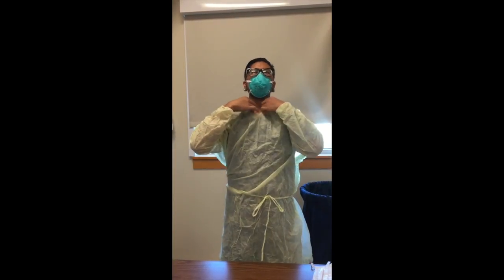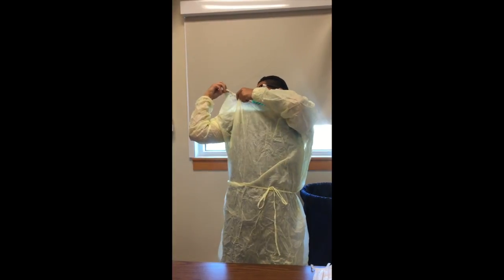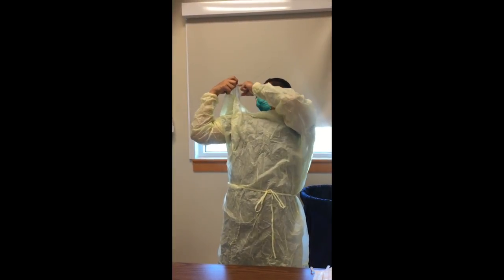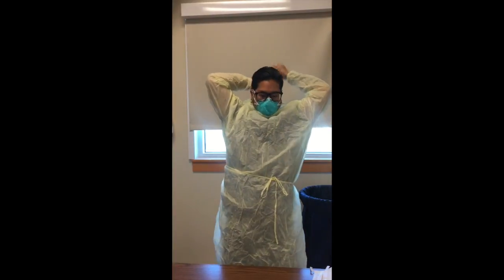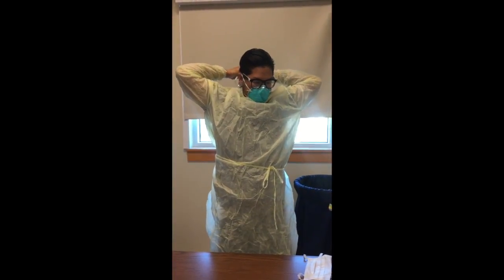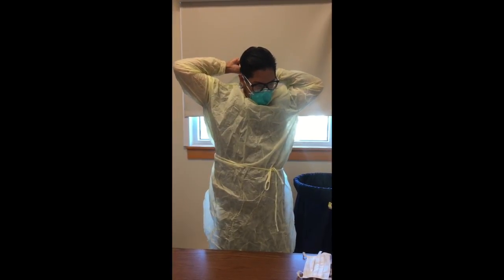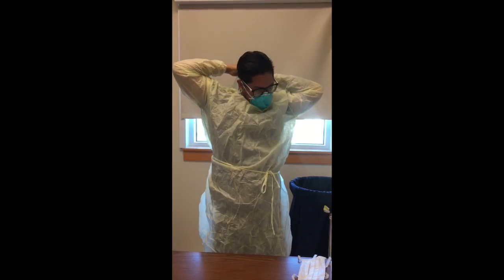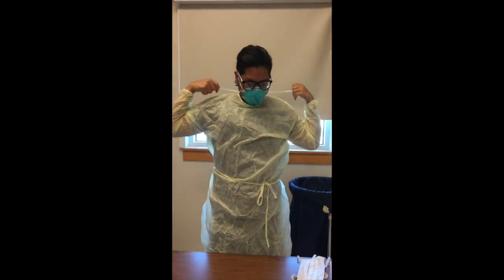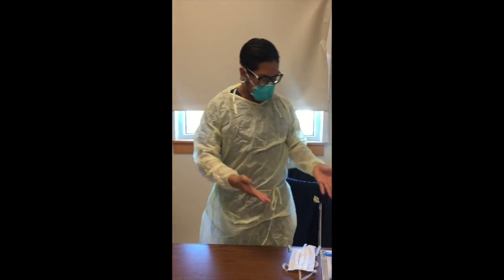Okay. And then the back part. I hate putting this on. Okay. So once that's done, you can go and put your gloves on.